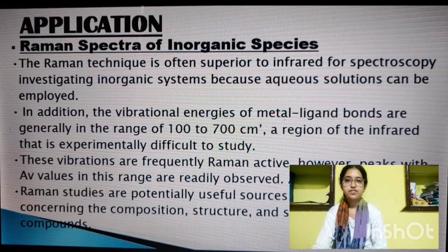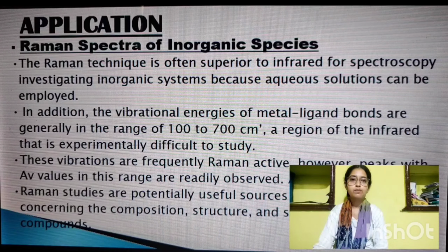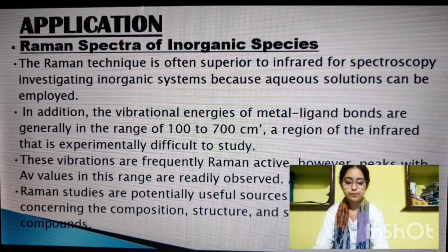So these vibrations are frequently Raman active. Peaks with Δν values in this range are readily observed, and Raman studies are potentially useful sources of information concerning the composition, structures, and stability of coordination compounds.